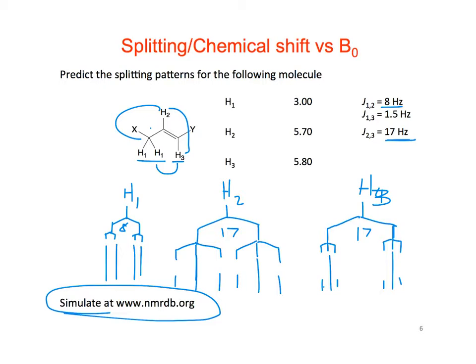And I notice the chemical shifts here. So H1 I have down at 3 parts per million, and H2 and H3 have almost the same chemical shift, so they're very close together. So that's going to create second order coupling. And all we're going to look at is these 2 protons. It's this one here. These 2 in the middle have come very close together, just because the triplet coupling constant is getting close to essentially half the size of the big doublet.